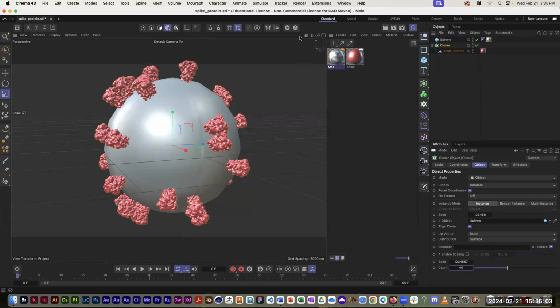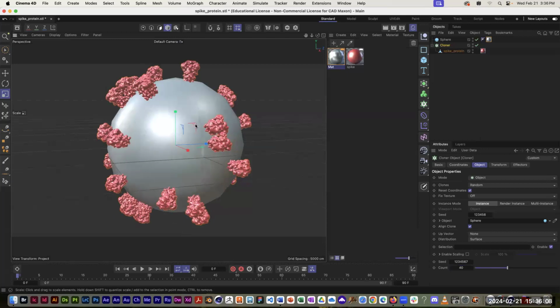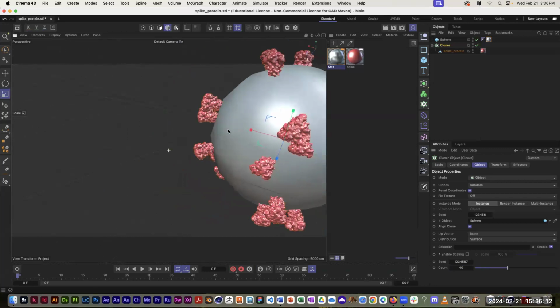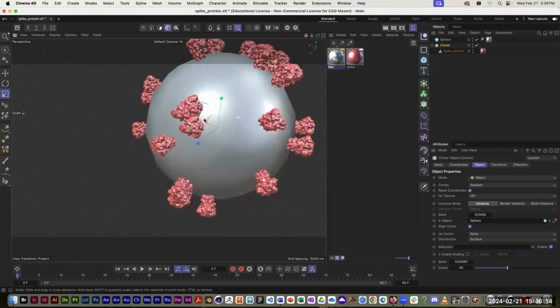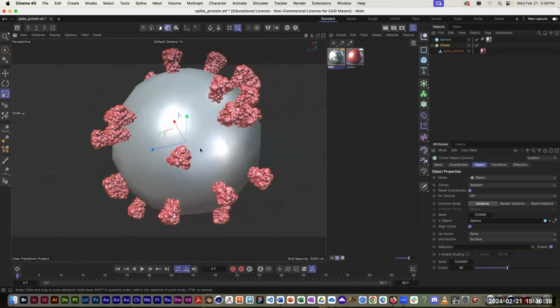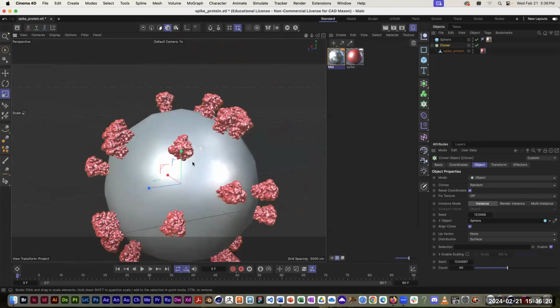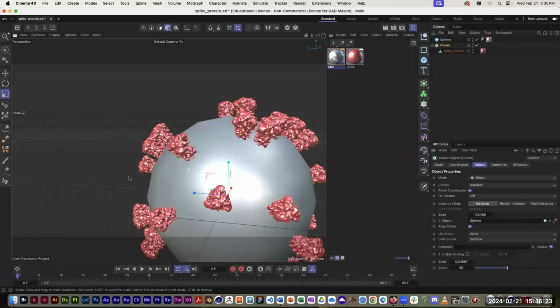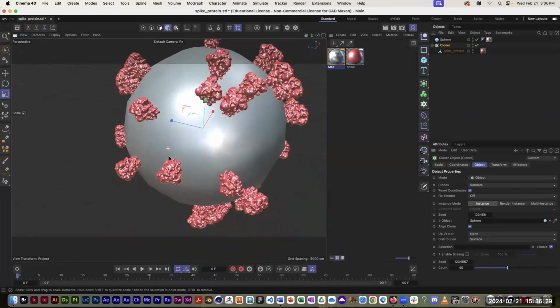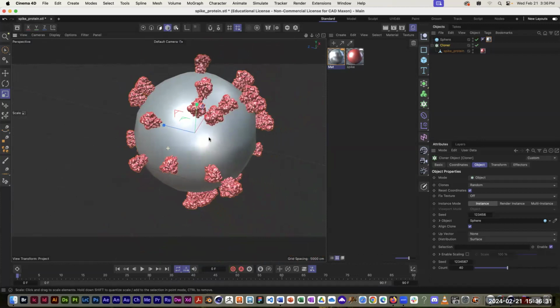One problem that I've always had with this is that I feel like it puts them very densely clustered in some areas and has hardly any in some other areas. So one possible way to deal with that is to just literally move it around until it looks like the right number, give or take. Just kind of rotate around until it looks about right.